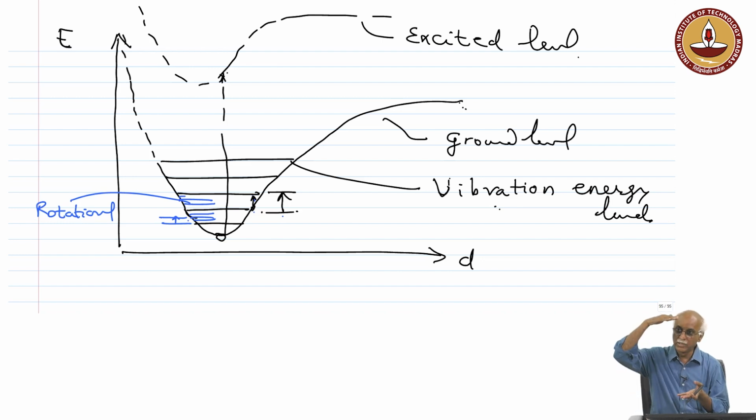because the energy gap is certainly large. So, they result in the UV region, etcetera. All these energy levels have certain rules for particular vibrations, oscillations, etcetera.